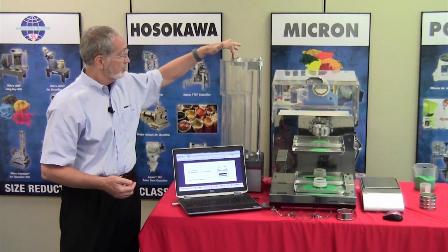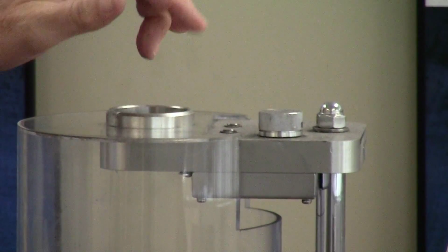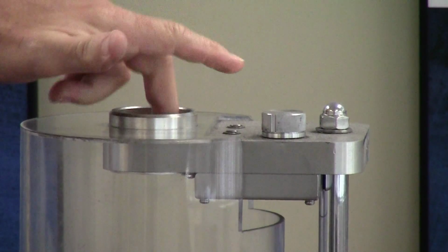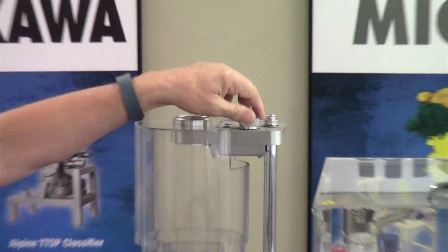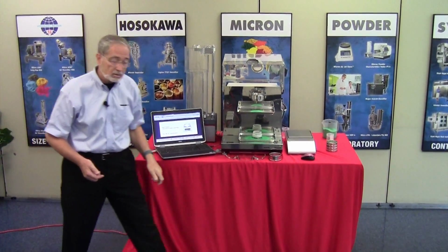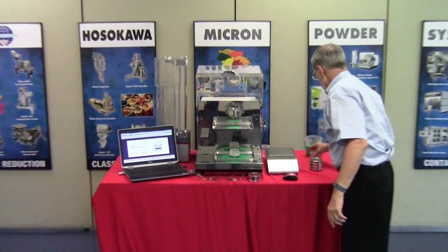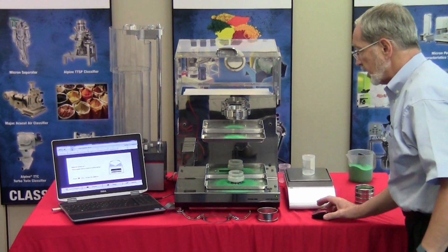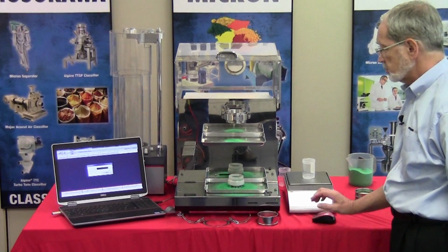One other thing that you should also recommend is make certain that the gate is closed here. There is a gate here that has an opening that you can see will pass. It works in a counterclockwise rotation. Okay. So now what we'll do is we'll then again tare the balance with the sample holder in place.